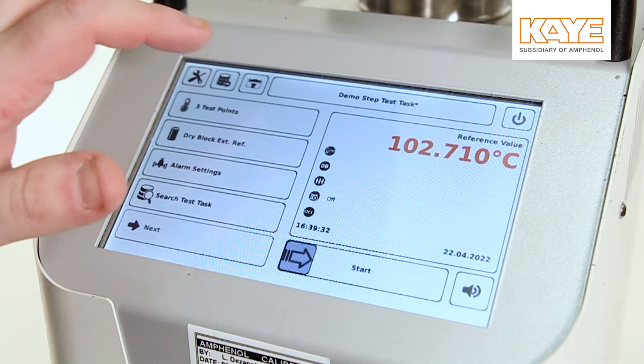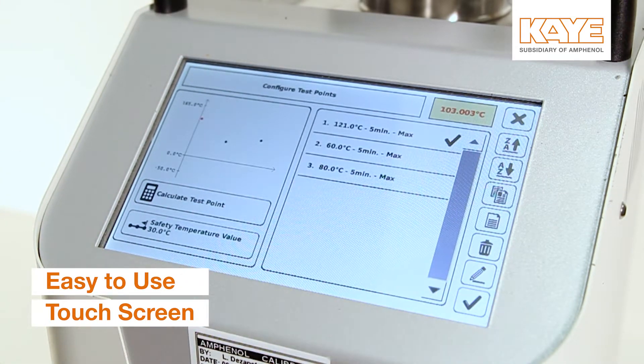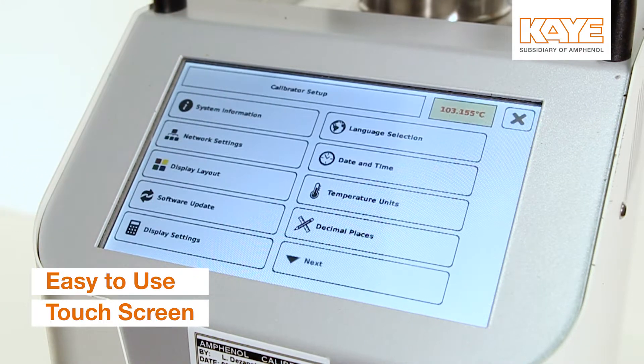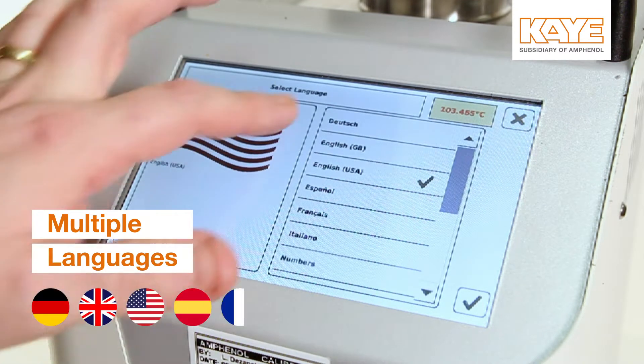The LTR-150 includes a large, easy-to-use touchscreen which allows the operator to quickly change from automatic to manual modes, as well as define setpoints, display settings, and languages.